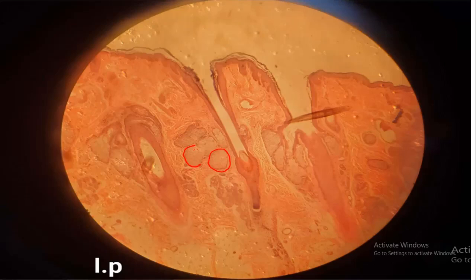You need to pick a few cells, 4 to 5 cells, which are adjacent to each other. You pick them, draw them, and simply label them. Now, what are you labeling in these cells? One thing you're going to label is the plasma membrane for those adjacent cells, the nucleus, the nucleolus, and also the cytoplasm. Those are the things that you need to draw for these slides.